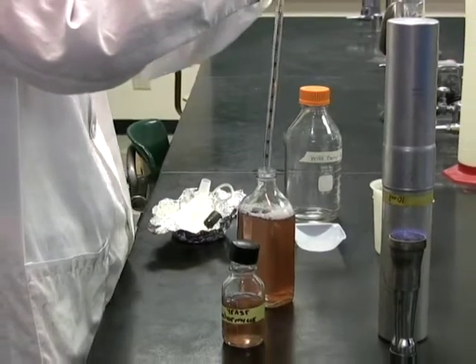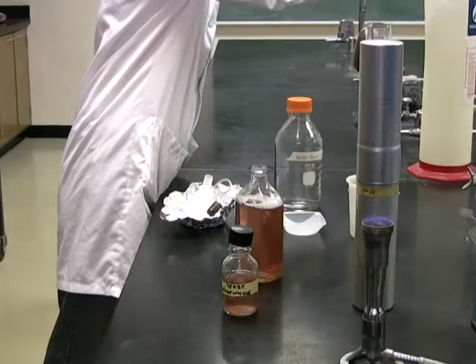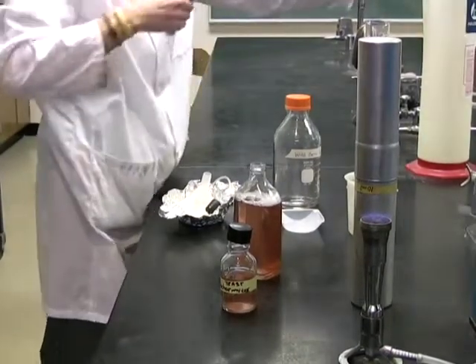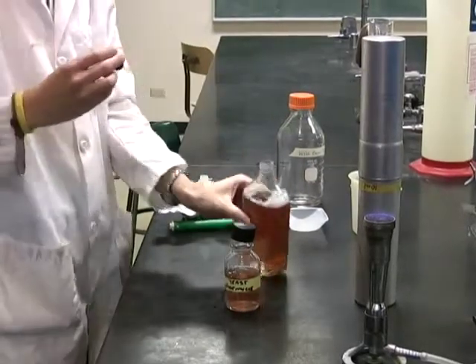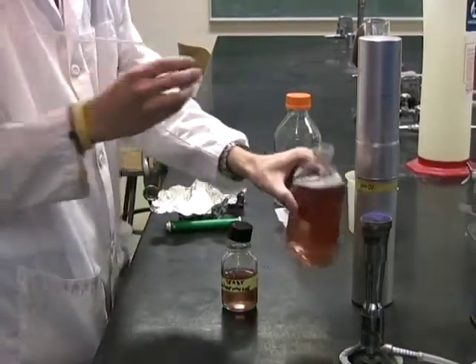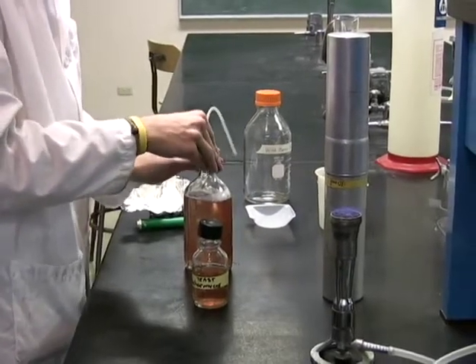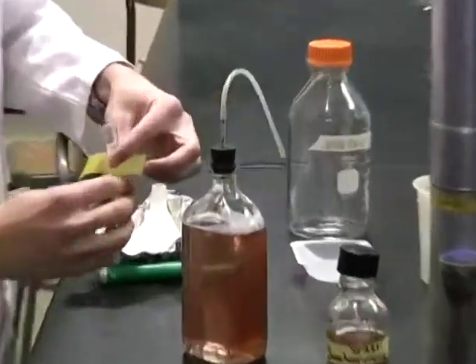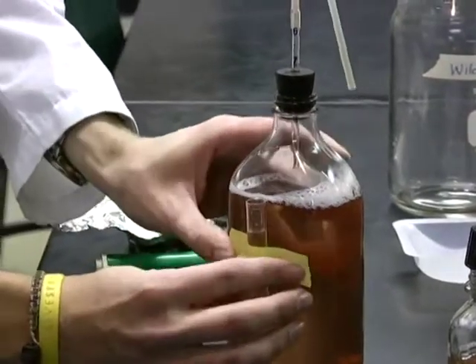After adding the yeast culture to the bottle, you want to close the bottle with a stopper. Using a small culture tube, fill it about three-fourths full with water and tape it to the side of the bottle. You will now place the free end of the rubber tubing into the water-filled tube.